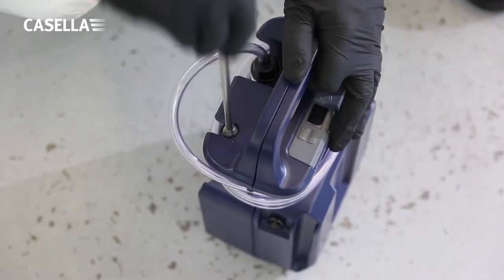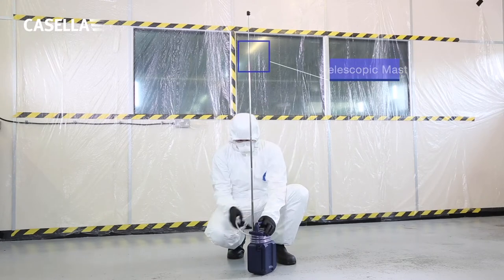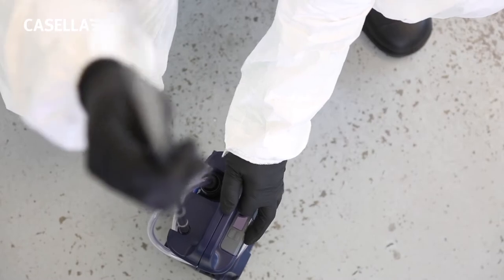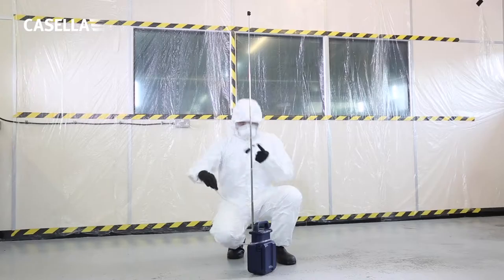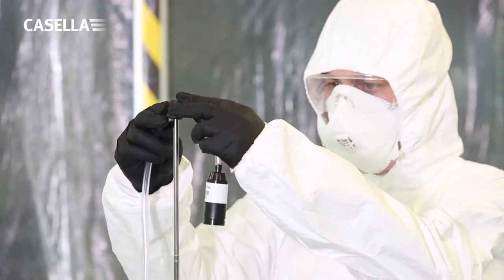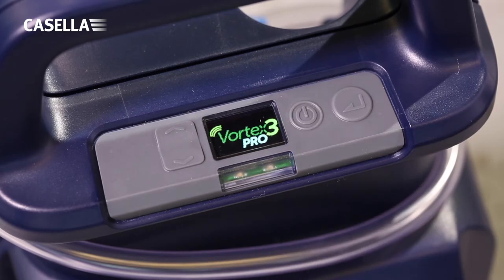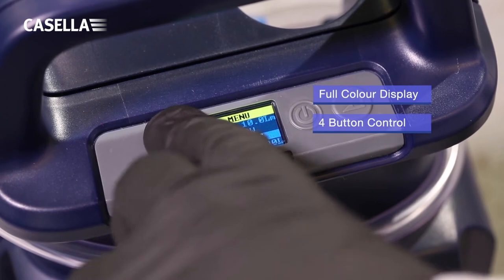The Vortex 3 is a complete air sampling pump that includes a captive telescopic mast used to support the air sampling tube, for maximum flexibility in sampling heights up to a nominal 1.6 metres. The Vortex 3 pump has large buttons that are easy to use even when wearing gloves.